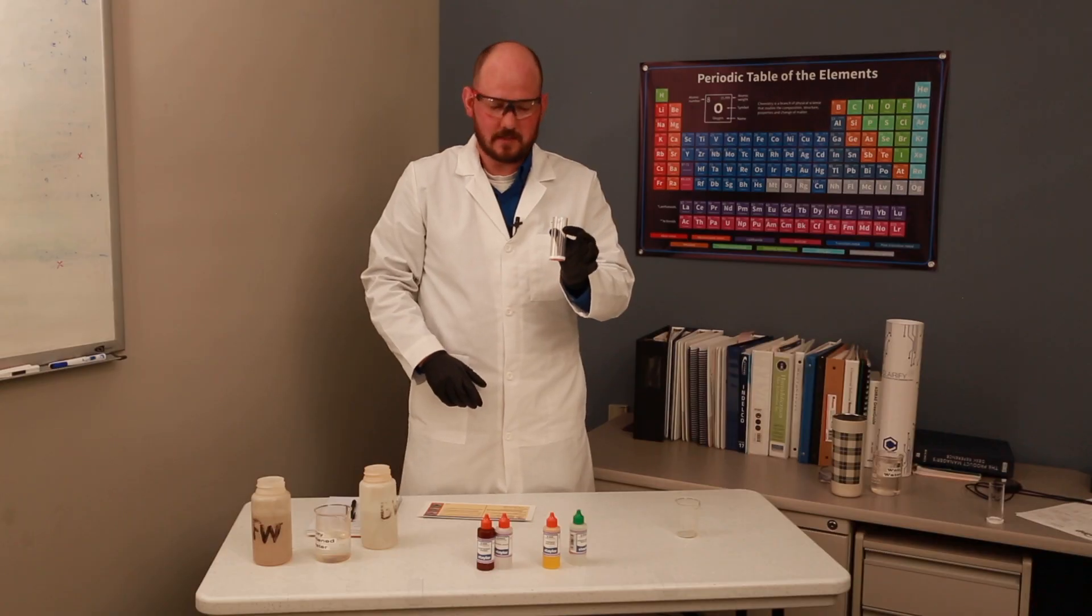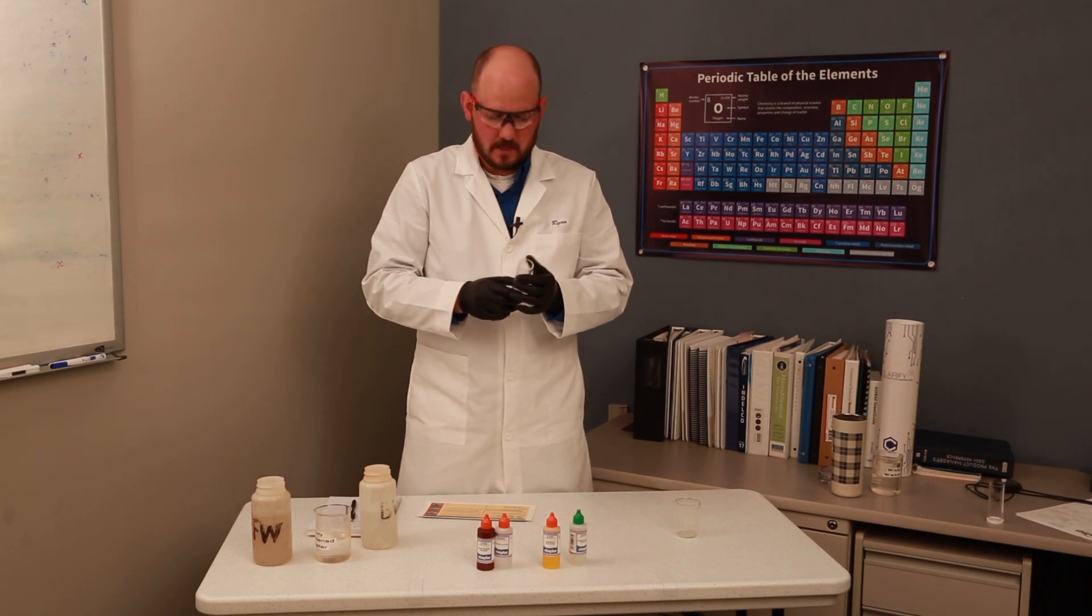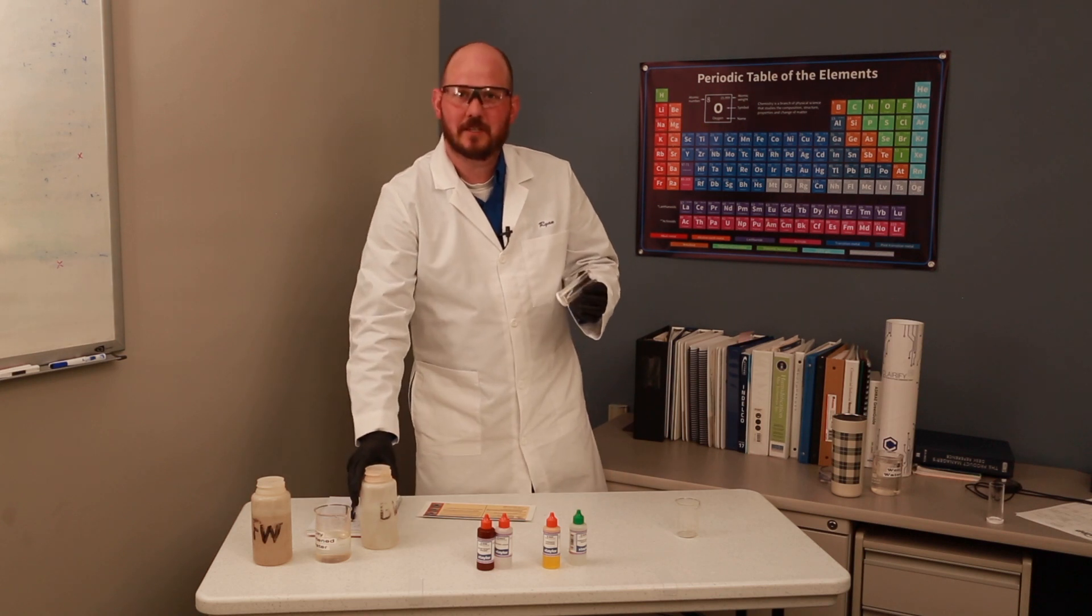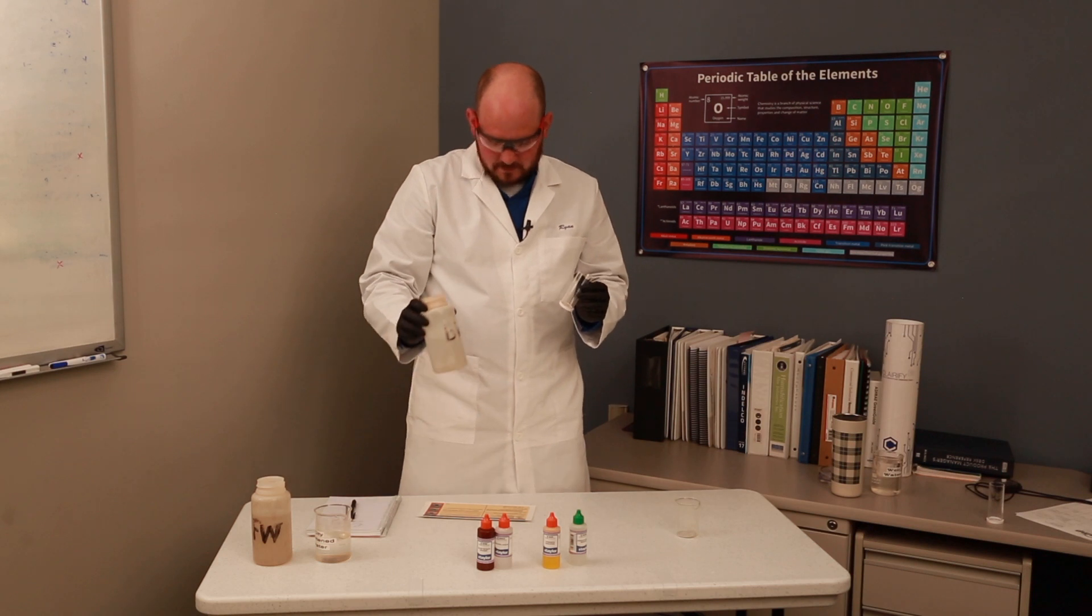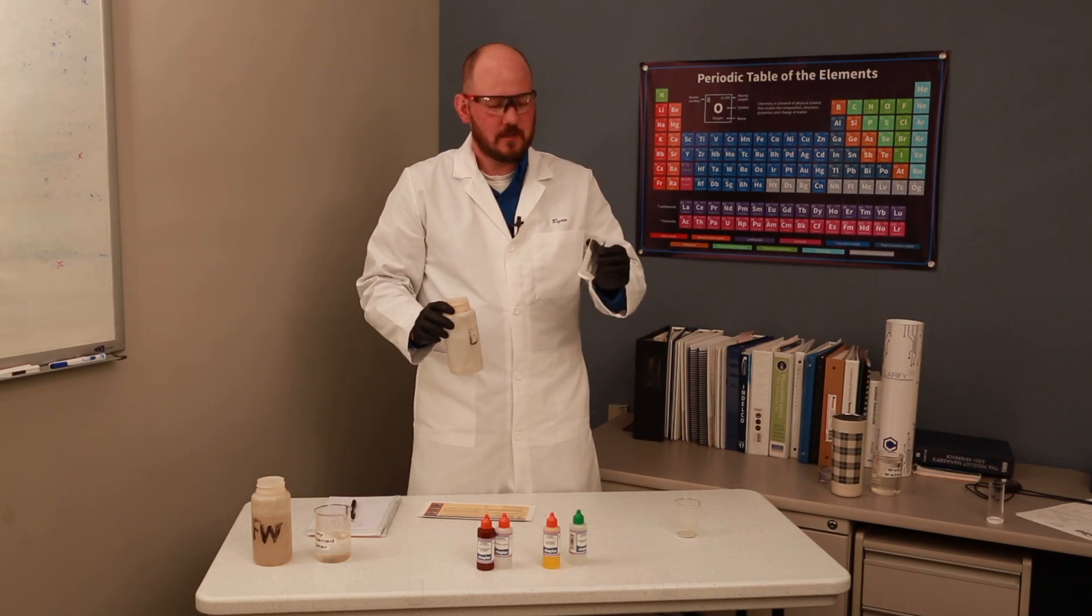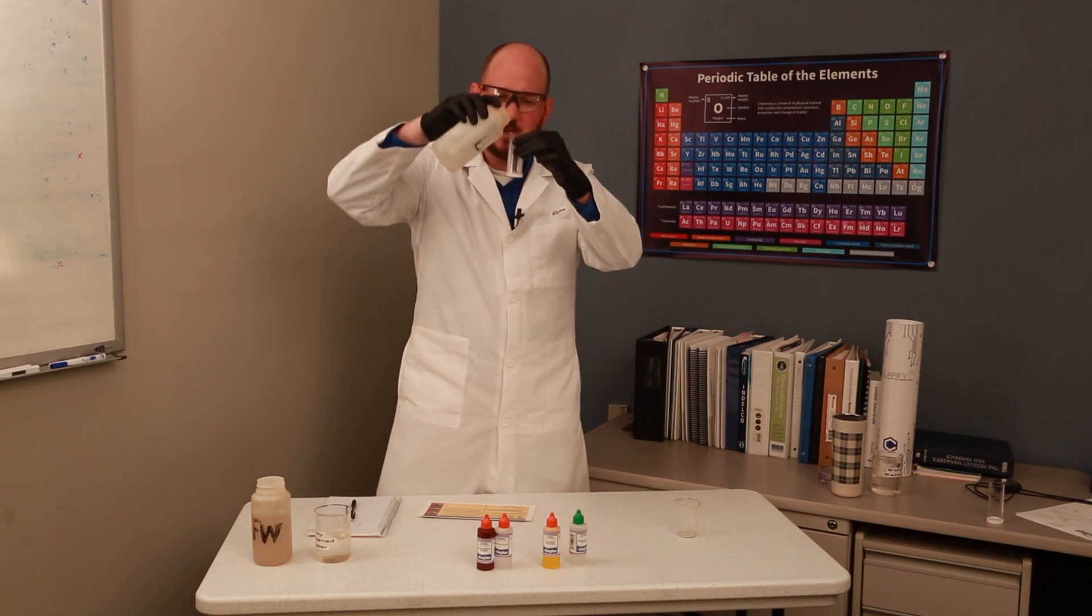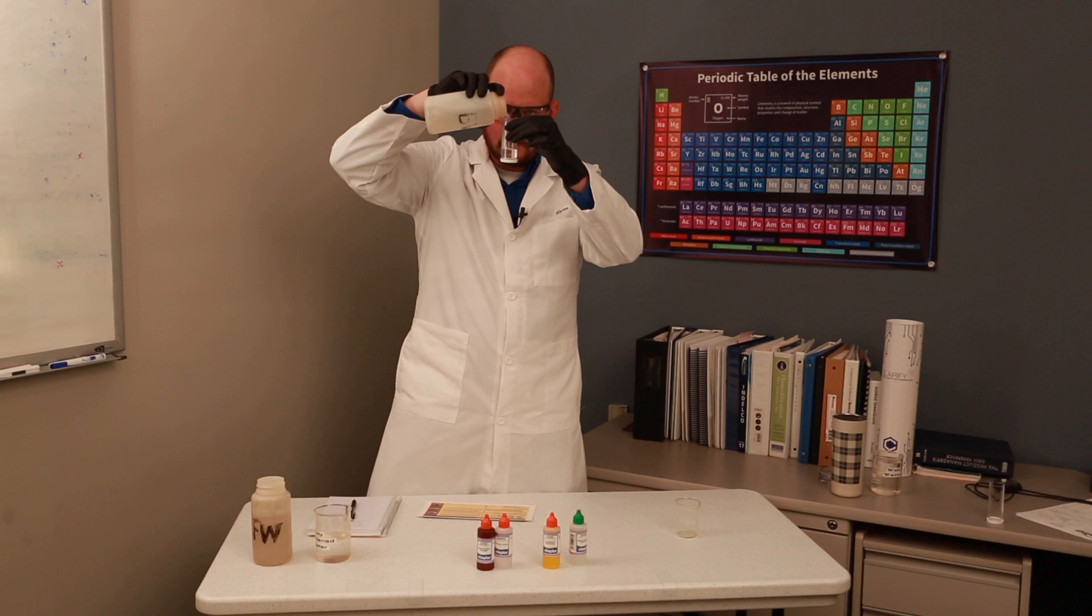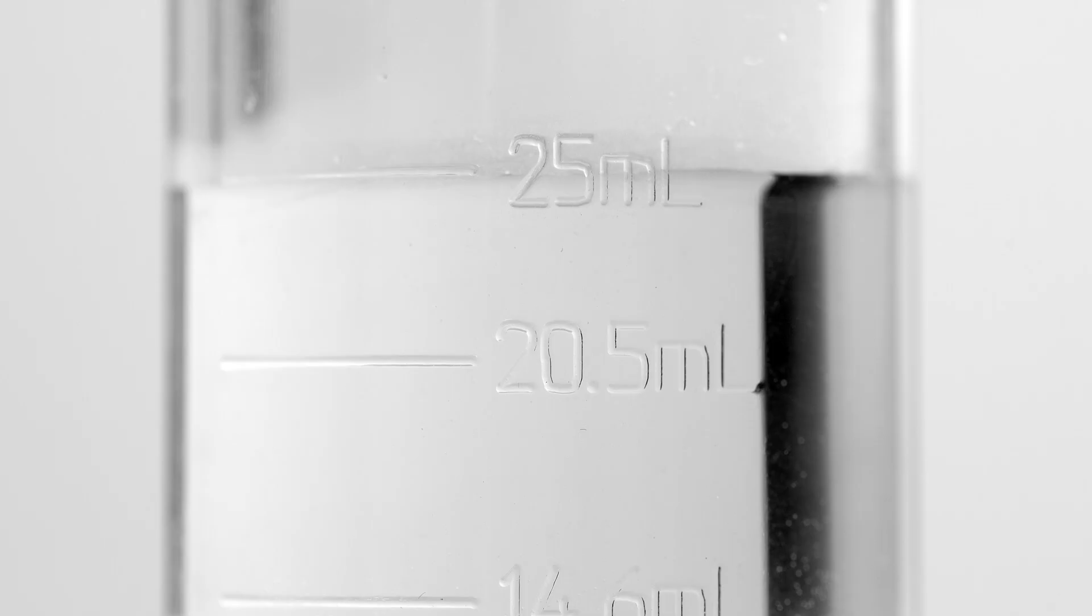We're going to start with the sample size. There are multiple options for this. Knowing where your water is going to start is the best place to guess what amount you want per drop. I'm going to choose one drop equals 10 ppm. So with that, I need to fill this up to 25 milliliters using the lines on here. I'm going to take my sample water and fill it to 25 milliliters. I am right at the line. Make sure the bottom of the meniscus is the part you're measuring from.